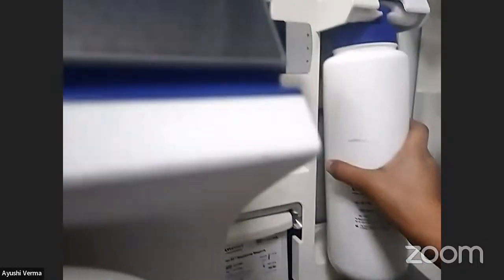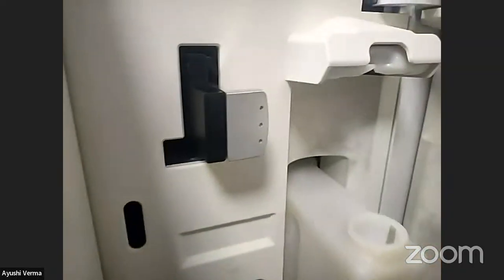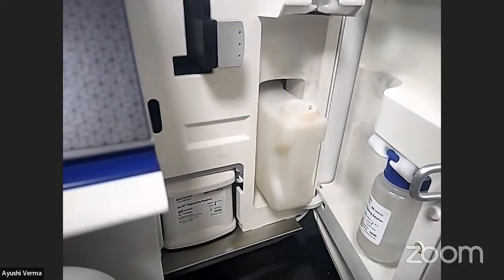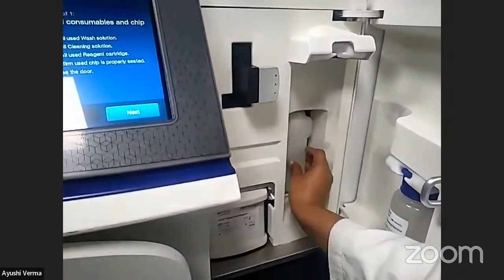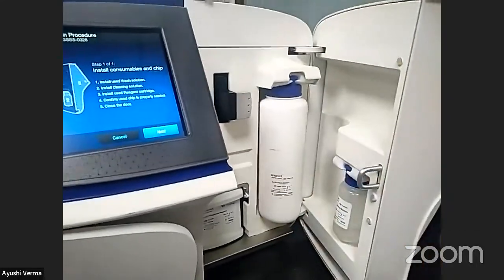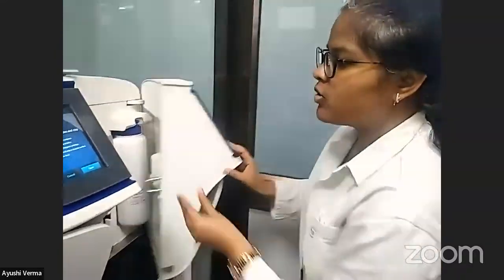And here we can also spot the waste collecting container, where all the waste of the sequencing reaction will go, and you have to clean this cartridge after the sequencing reaction is complete. So you have to be very cautious while checking that all the things are in place. And once that is done, you close the instrument.